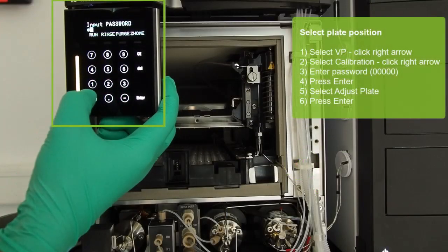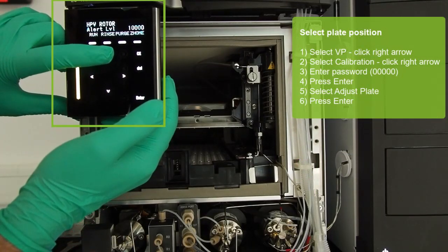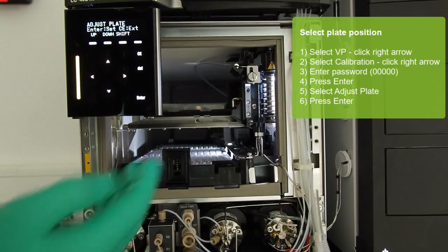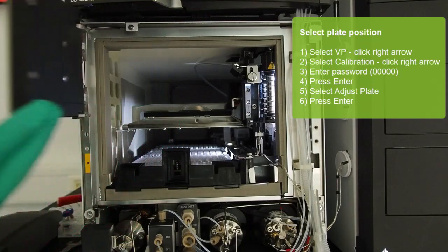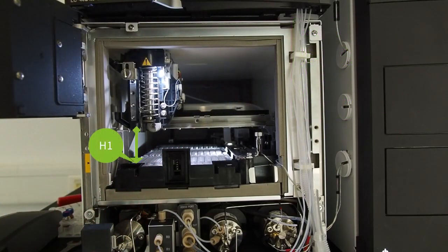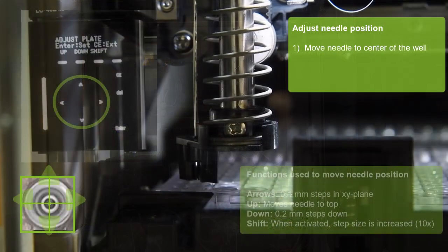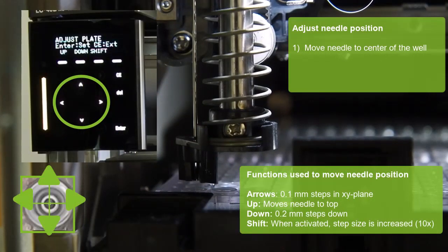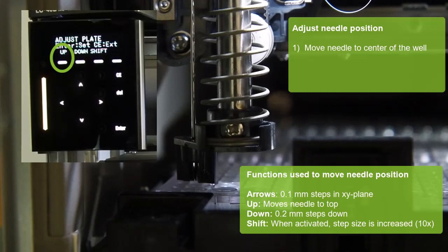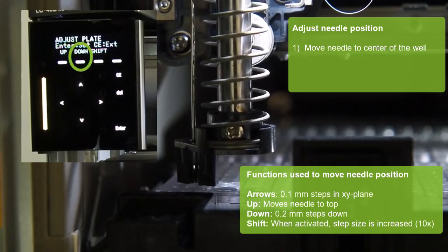On the auto-sampler operation panel, follow the instructions as shown. Once you select enter, the needle moves and stops at the front left corner of the front plate, that is position H1. Our goal is to move the needle to the center position of the well. Use the arrow keys to direct it back, front, left, or right in 0.1 mm steps. Selecting up will move the needle to the top. The function down moves the needle down in 0.2 mm steps.